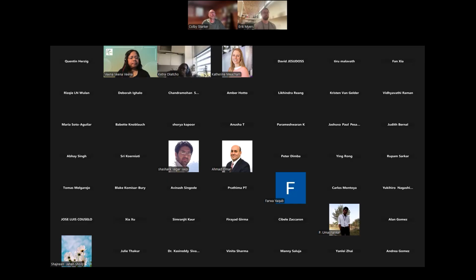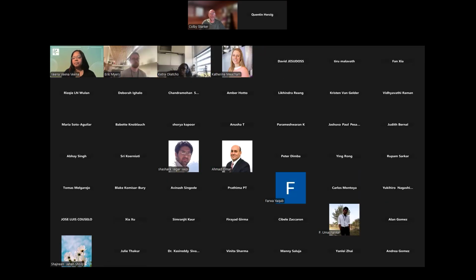Hi. Thank you guys for hosting this. I wanted to ask what the possibilities are and what the process is like for using technologies such as prime editing to deliver short sequences to promoters of Arabidopsis genes. We're interested in trying to insert very short enhancers in promoter regions, but I don't really come from a CRISPR background.